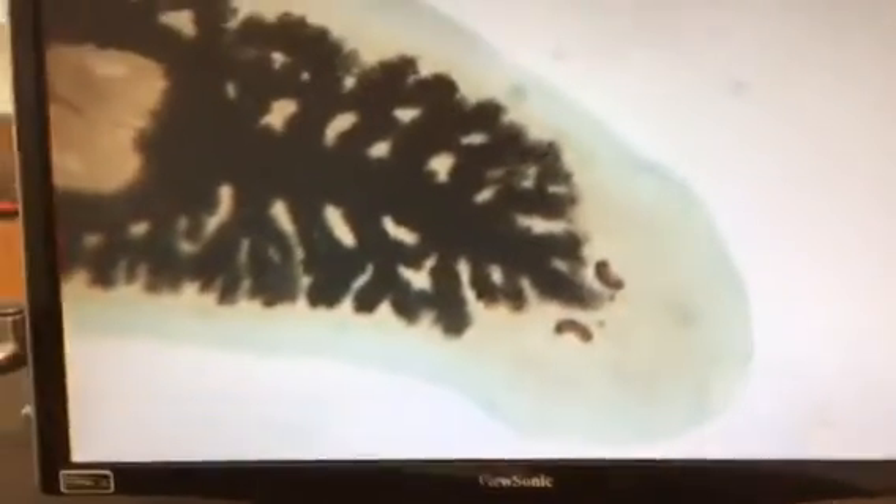Platyhelminthes. What genus? Dugesia. What order is this? Tricleida.